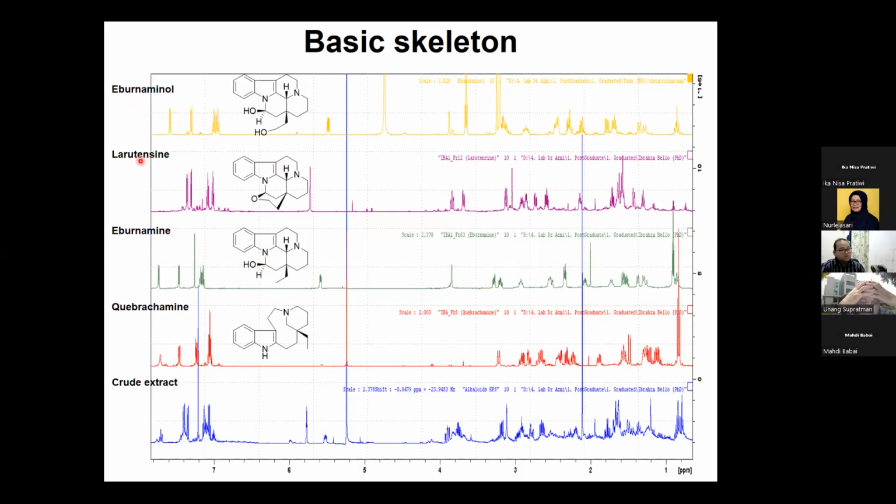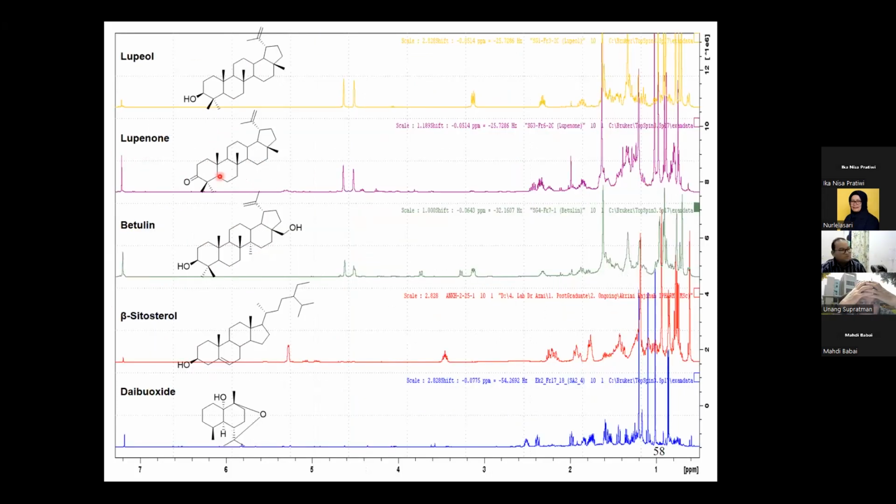If you are doing natural products, astaghfirullahaladzim, there are so many things that you can explore. Another example, if you are working on terpenes, for example the Diospyros species, you can find lupeol and lupenone. The difference is only the functional group in this, I think, A ring. Instead of OH, they have a ketone.